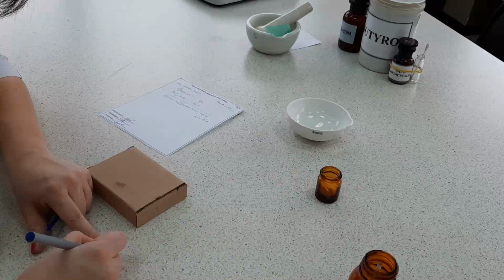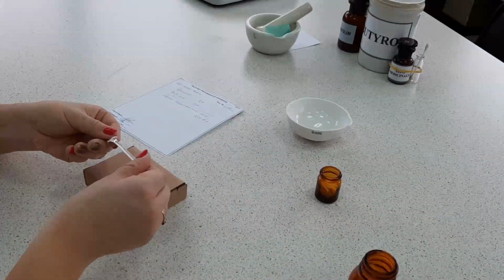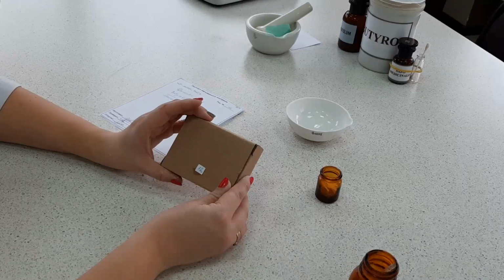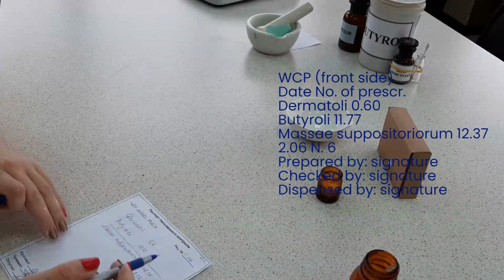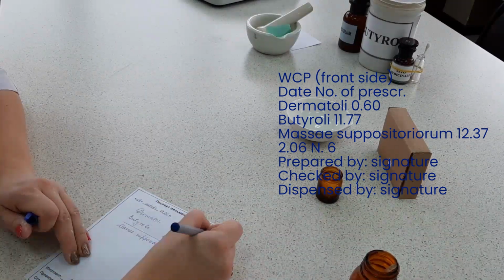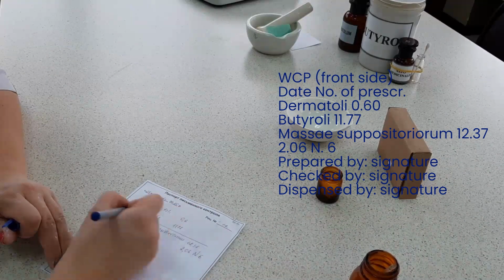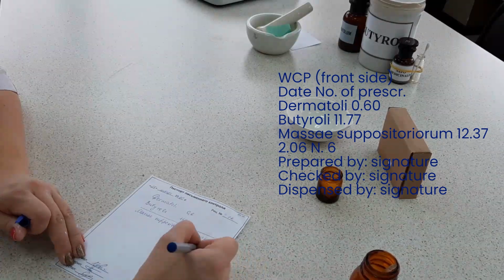From memory, fill out the front side of the written control passport. Dermatoli 0.6, Butyroli 11.77, Massa suppositoriorum 12.37, 6 suppositories of 2.06 grams each.